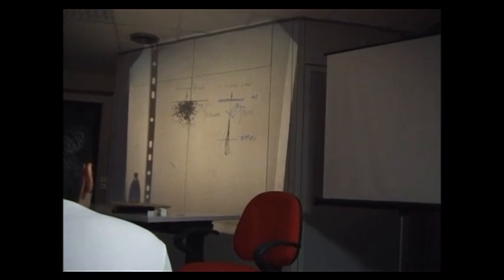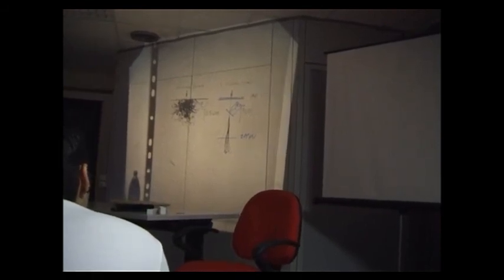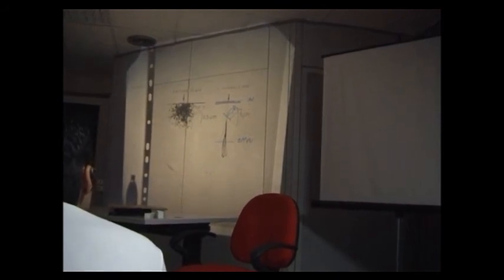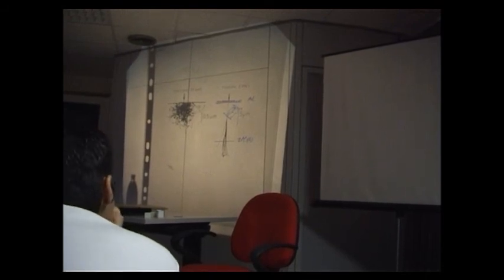Those particles cross this foil of aluminum and they can reach several distances in material and then in the air. When we send 2 MeV protons across a foil of aluminum of about 10 microns, it's possible to see the beam of protons coming up to 12 to 15 centimeters in the air.